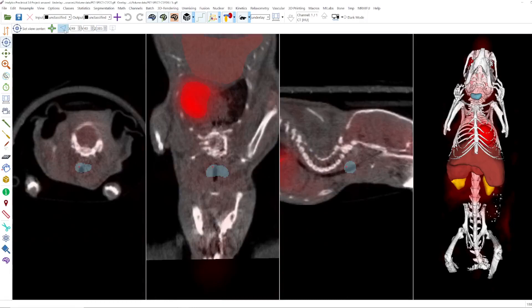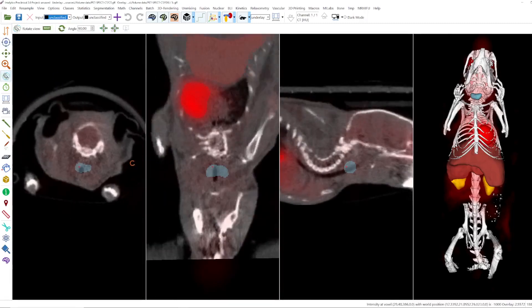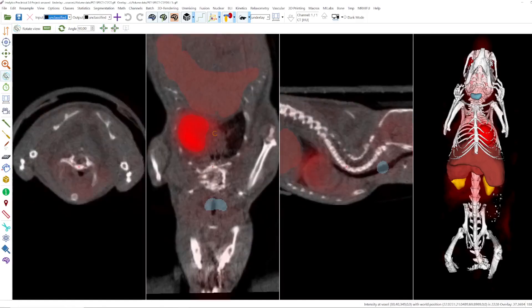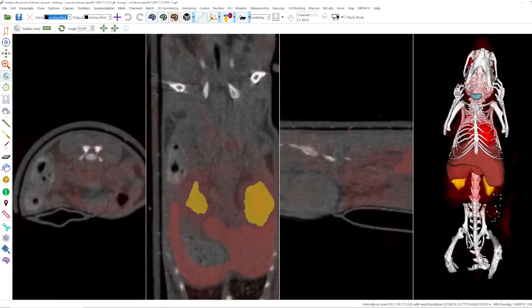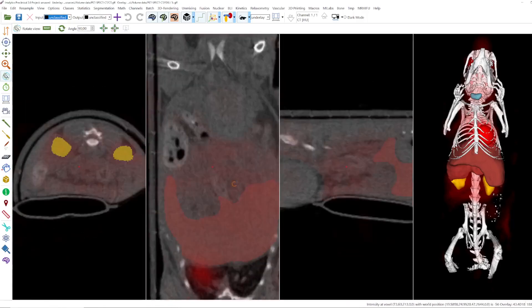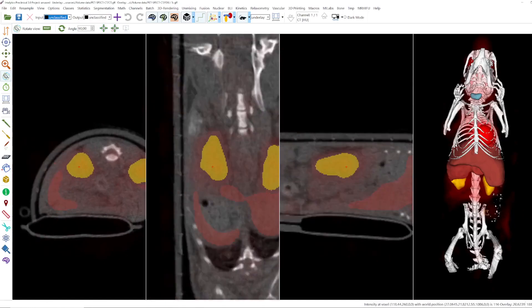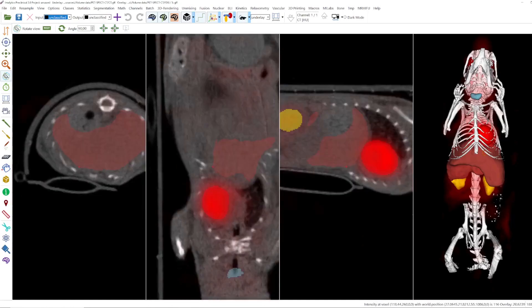You can use the mouse to set a new view center even when you have another mouse mode activated. For example, if I'm in the rotation mode, I can use Control and the left mouse button to jump wherever I want. That works in 2D and also in 3D. I hope this helps. Thank you. Bye bye.